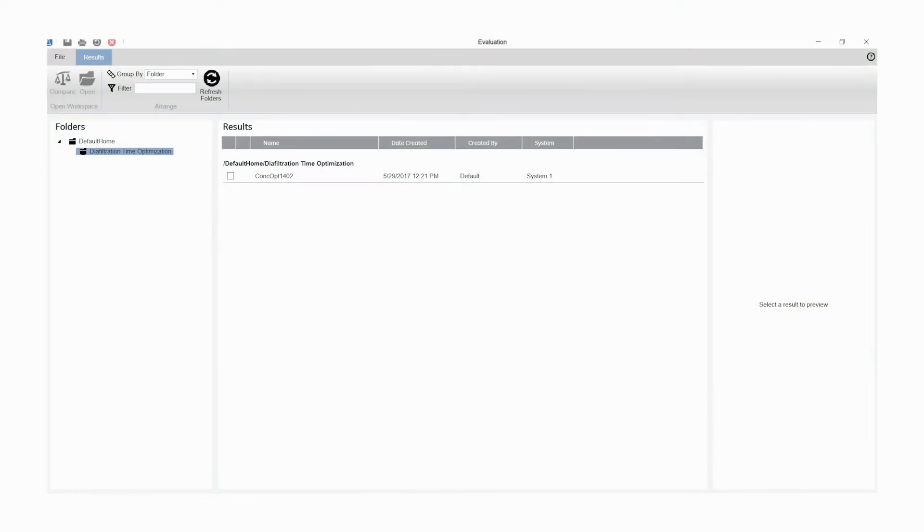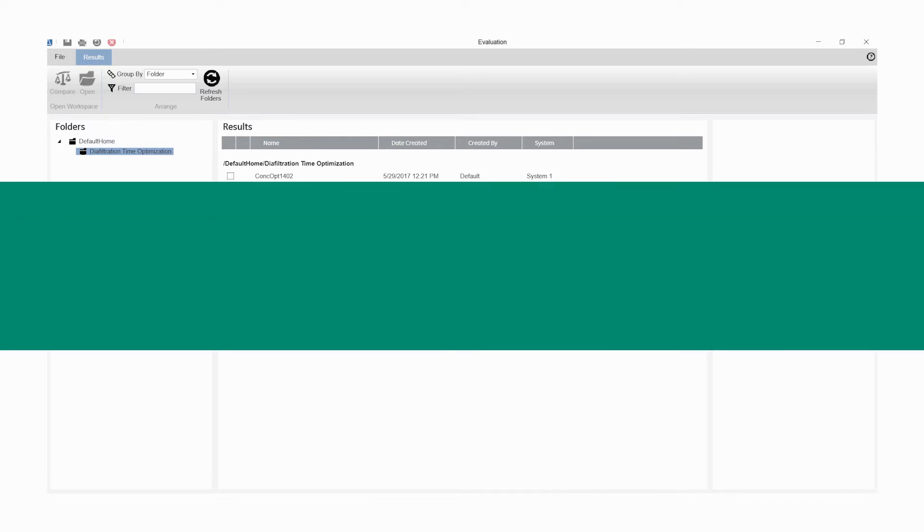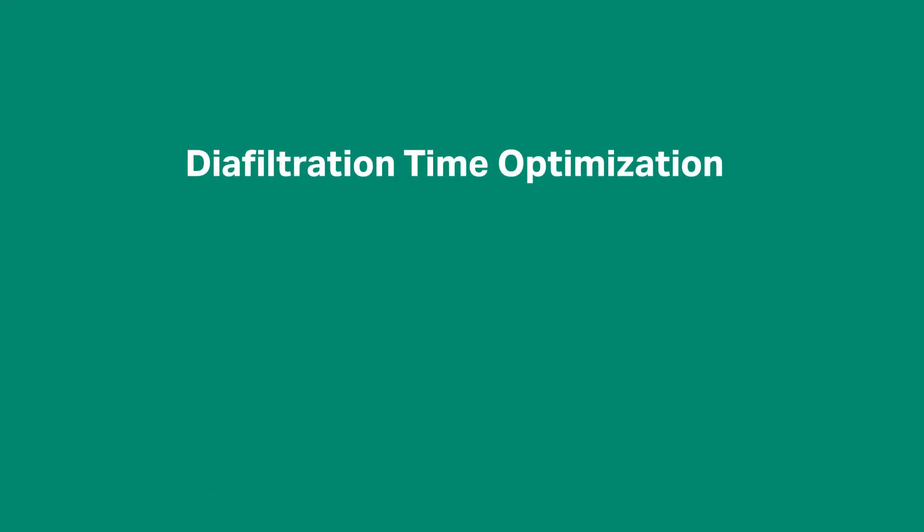Results from any filtration system using Unicorn Control can be evaluated with the Unicorn Evaluation Wizard. The diafiltration time optimization algorithm helps you to find the optimal concentration for diafiltration.